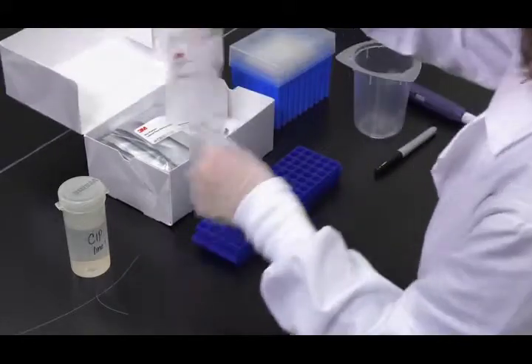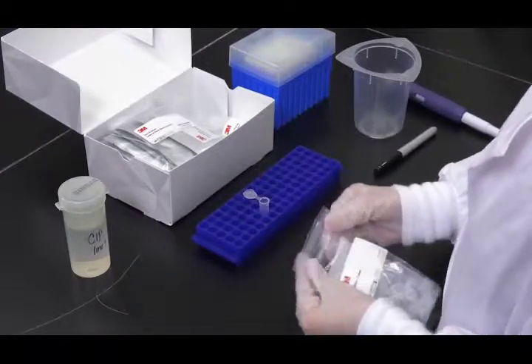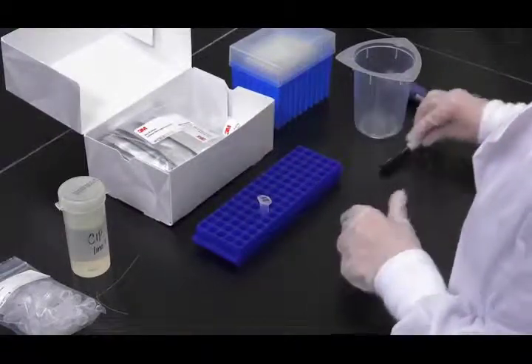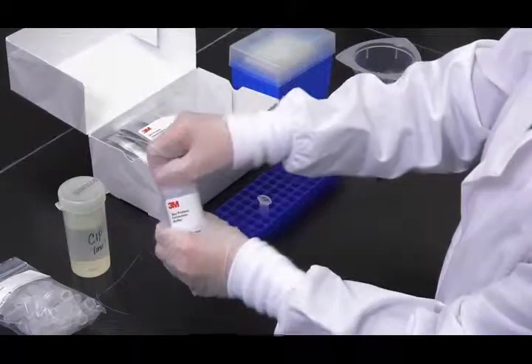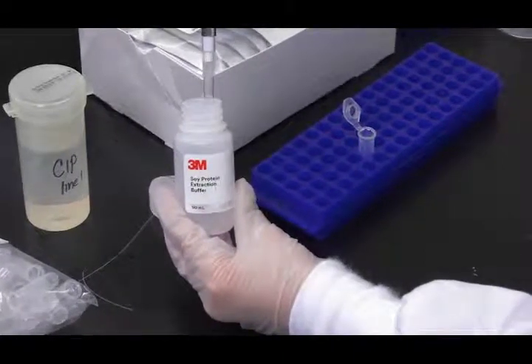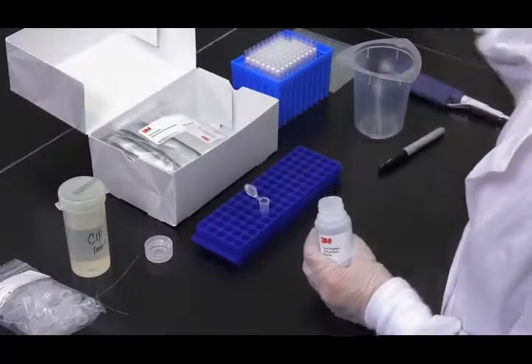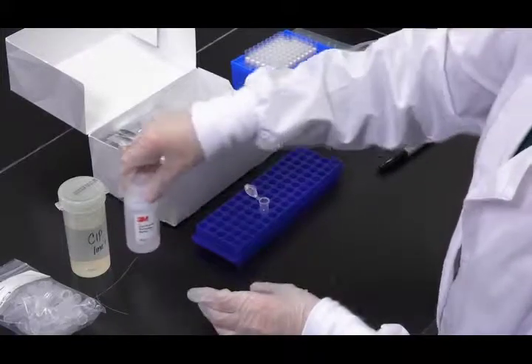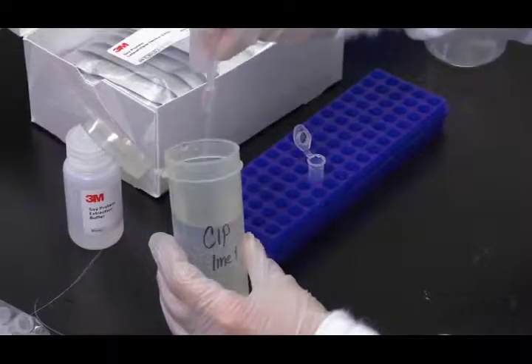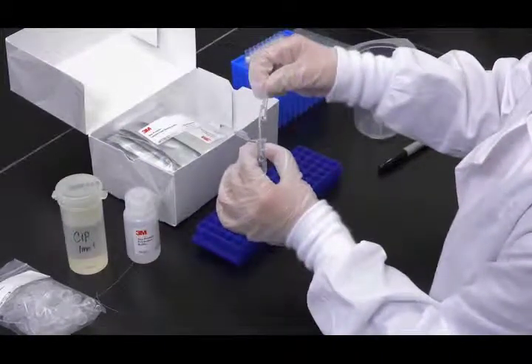To analyze clean-in-place CIP final rinse water samples, label one microcentrifuge tube for each CIP sample. Then add 800 microliters of 3M extraction buffer to a labeled microcentrifuge tube.